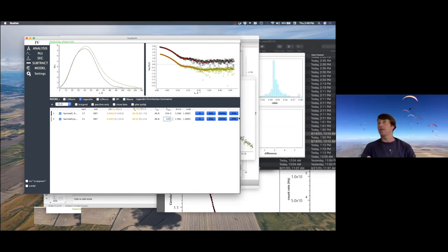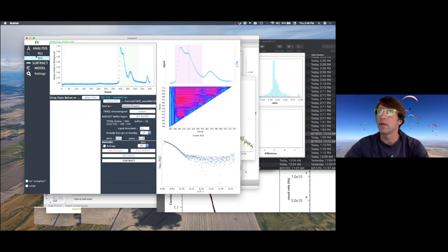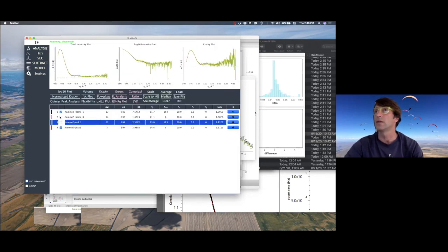Again, I have cases when I'm merging the peaks that are close to each other and EFA, they don't have exactly the same scattering profiles. That's just a test case that is really not distinguishable. In this case, you see this first, it's not so effective with the second peak because the scattering profiles are almost identical.